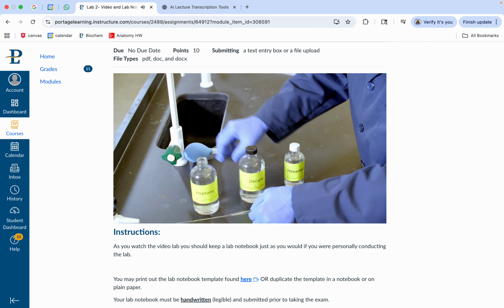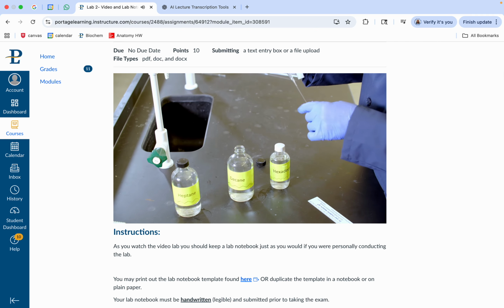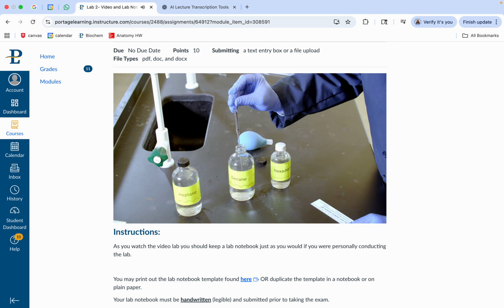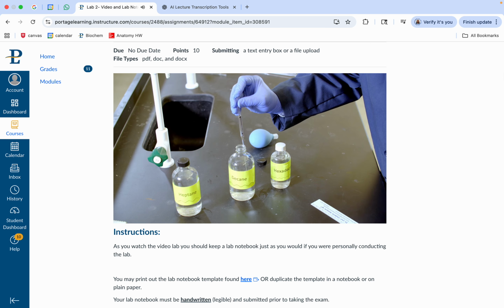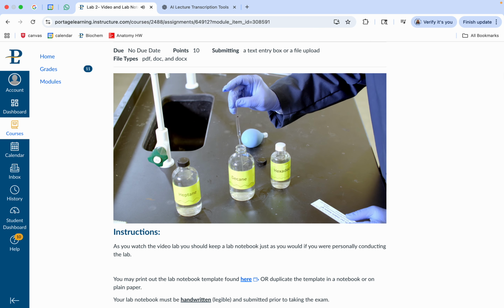All right, that was for our heptane compound, which again is 7 carbons in a row. Let's try 10. Make sure, so 10 carbons, which would be decane. So it's in position, so I'll say start, stop for that one. So this one's in position, so I'll say start, stop. So this one's in position, so start, and stop.